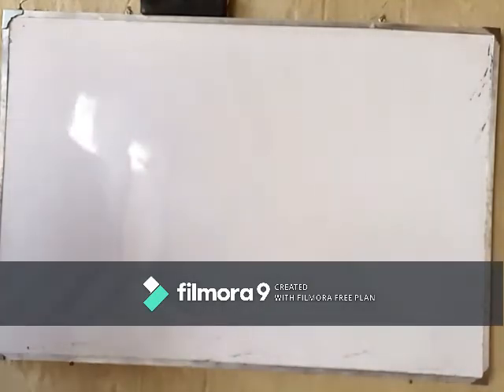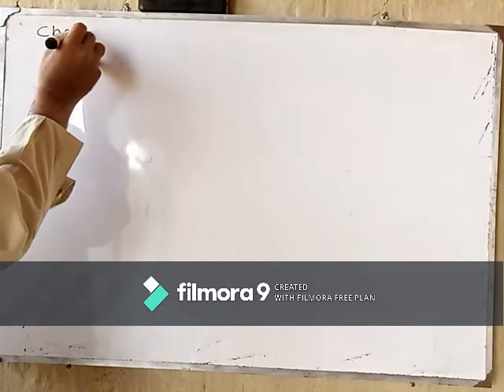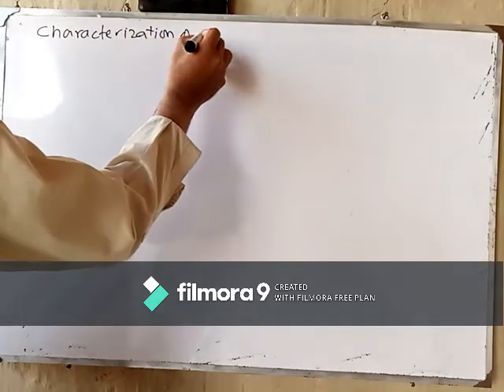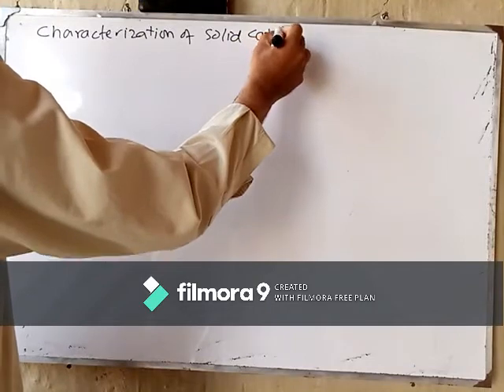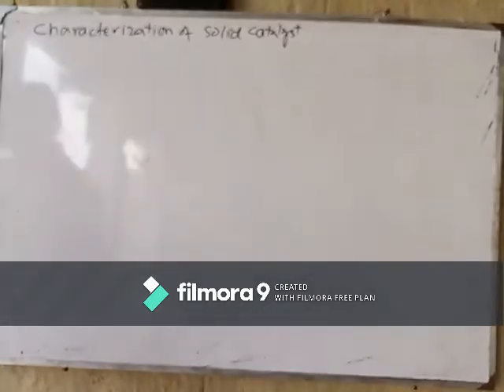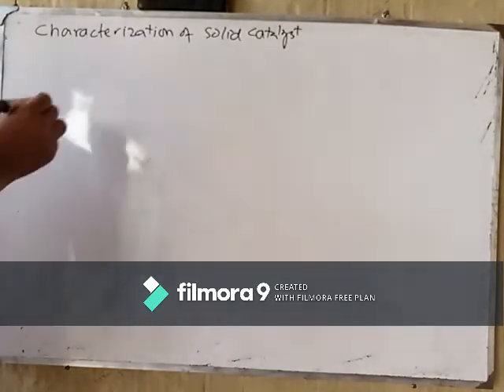Today we start the characterization of the catalysts. Solid catalysts. Characterization of the heterogeneous catalysts. In heterogeneous catalysis, reaction takes place at the surface of the catalyst.